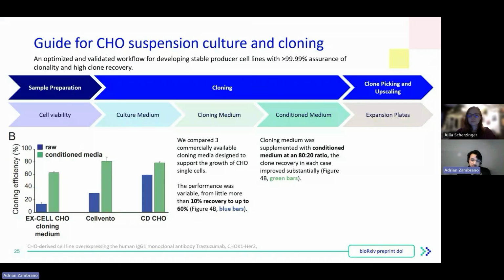One typical supplementation strategy, as we saw before, was using conditioned media. For example, it could be fresh medium mixed with medium used to grow other cells. This media already contains different growth factors and signaling molecules that can improve the outgrowth and survival rate, right?